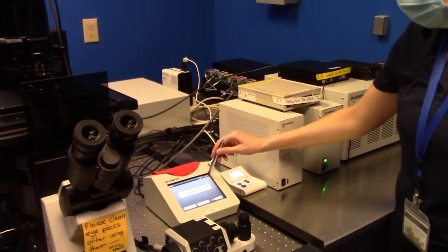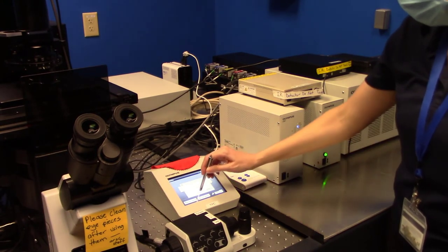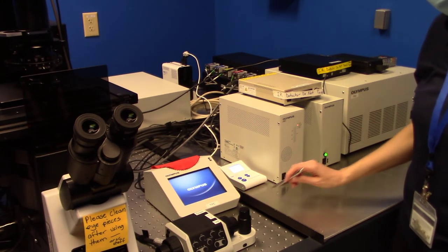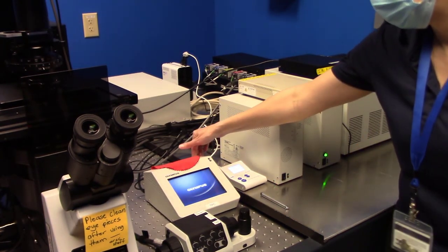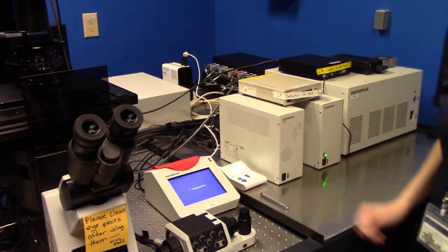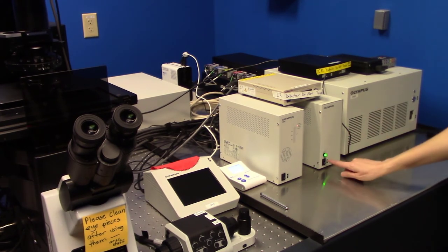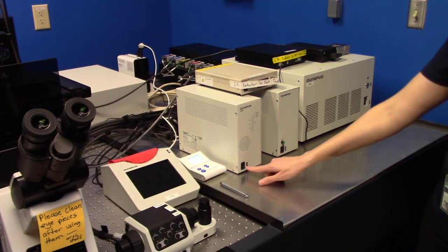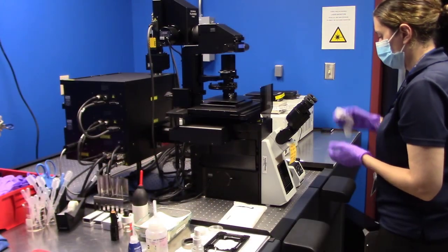Select the off button on the screen to turn off the TPC. The TPC window will appear asking if you want to exit. Select OK. After the Olympus screen appears, press and release the button on the back of the TPC. Wait for the TPC to fully shut down and turn off box 2. Next, turn off box 1, the CBH, and position oculars vertically.